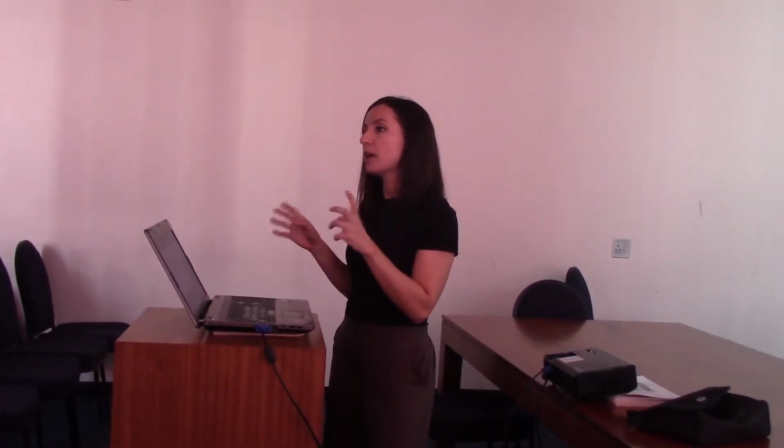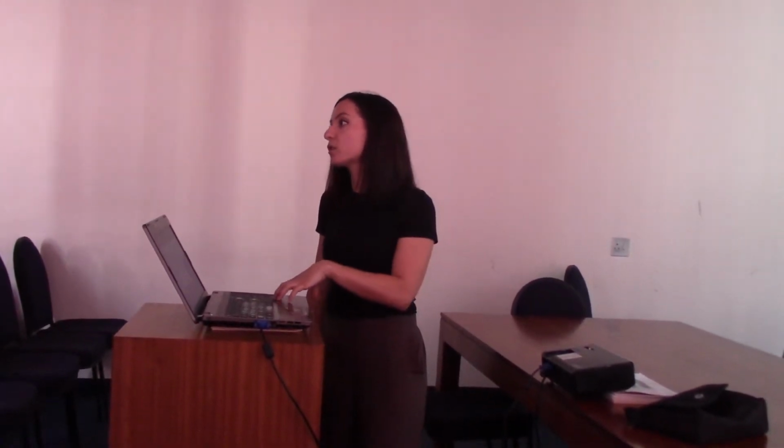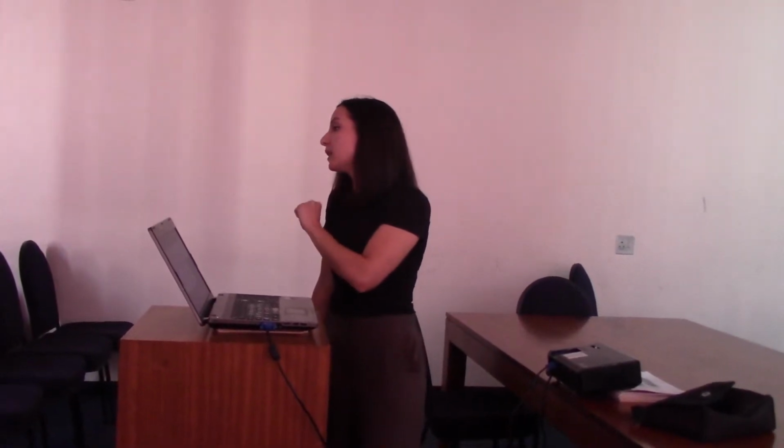There are a number of RNA stabilization buffers that you can use just to stabilize your RNA and make sure that at the end of your 2-year clinical trial, your samples you collected 2 years ago aren't degraded. So it's very important to be able to think about how the RNA was preserved and is the RNA still good quality, especially if you're doing the bioinformatics analysis downstream and you're like, what's going on? These samples, go back and see how they were collected.